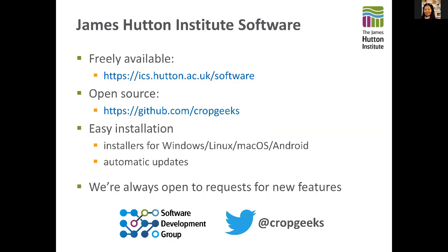Hi, Iain. So for CurlyWurly, do you need someone to really set up Yonder for broader users to use the tool to select? I'm not quite understanding the question there, Star. CurlyWurly is a desktop-based tool. Right, so once you have the data in CurlyWurly, you have a lot of pedigree information. Does one person in a group need to really set this up with the size and the color tune, or can any user use it directly from, say, Excel data output to the visualization? I think it's something that any user can use to explore their data, look at the different categories, and make their selections and sizing of the points within the view. It's a very interactive tool. It's quite easy to use. So the best thing to do is dig in and just play with your data.